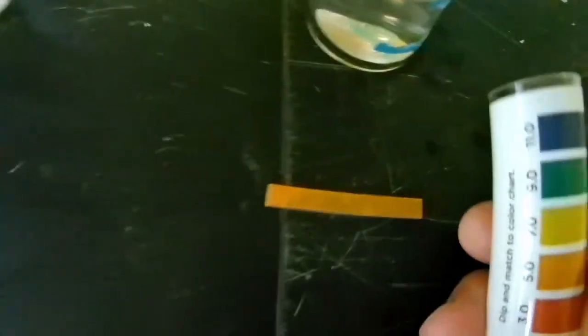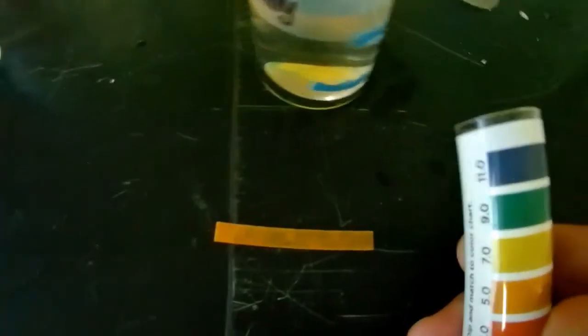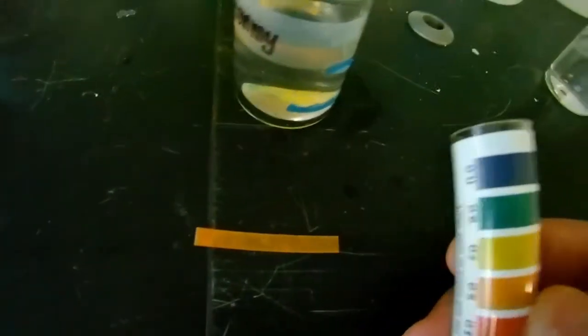With the ammonia, right now it's maybe slightly orange. That could be just the tap water is slightly acidic, but generally when we dunked it in, it pretty much stayed yellow.